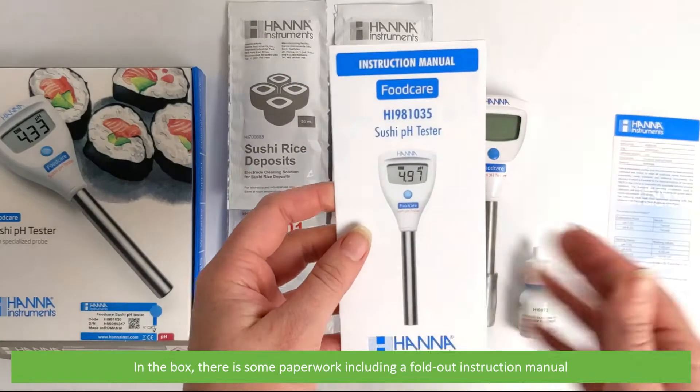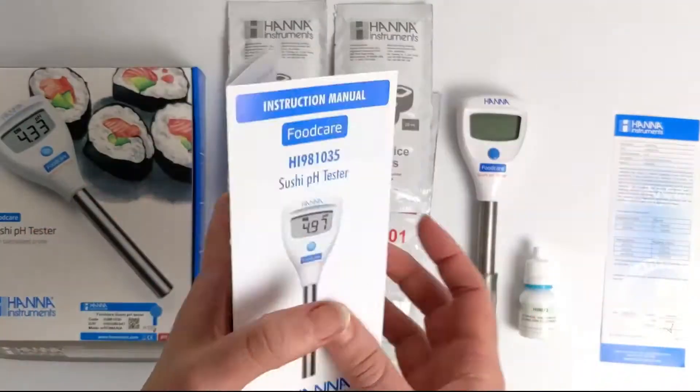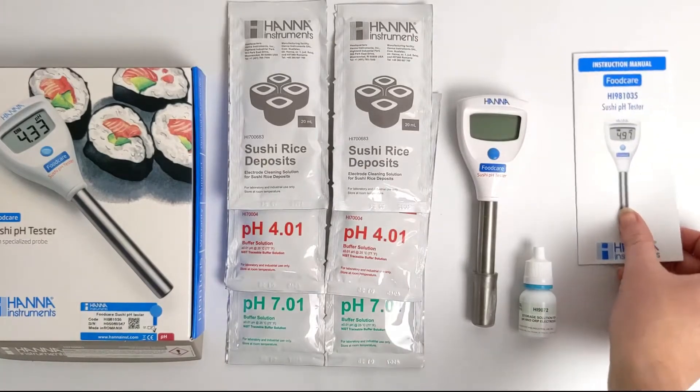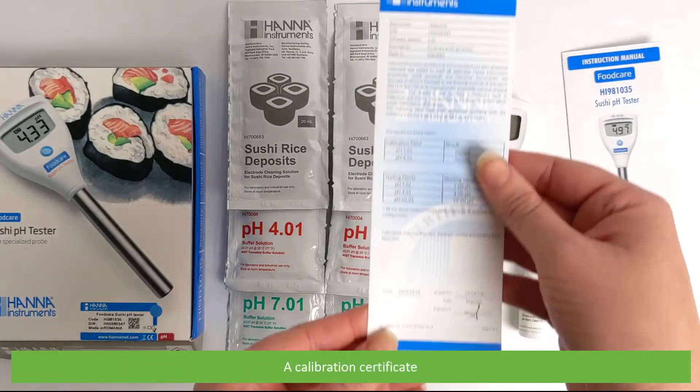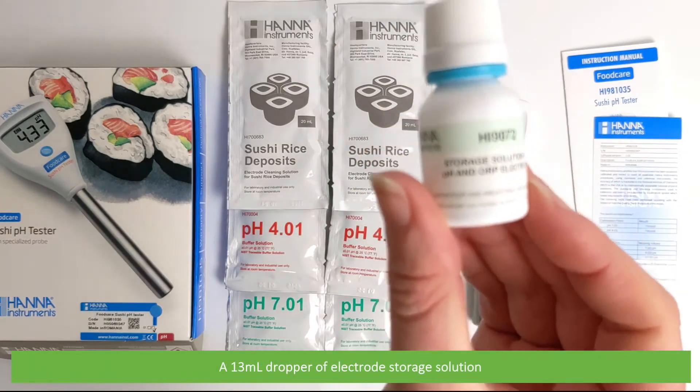In the box there's some paperwork including a fold-out instruction manual, a calibration certificate, and a 13mL dropper of electrode storage solution.